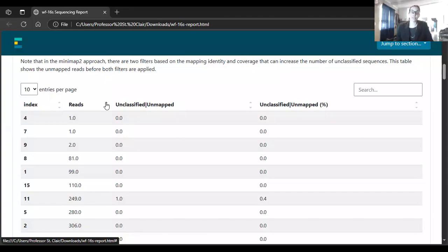Unfortunately, there were a few samples that failed sequencing on this run. Like I said, this is our very first time. So that's why it'll be useful to have your metadata handy, and you can look and see if your sample failed. For example, if you had sample 9, then you can find out which samples were from the same treatment, and then choose another sample that had the same treatment as yours. That way you'll be able to move forward with your graphs.